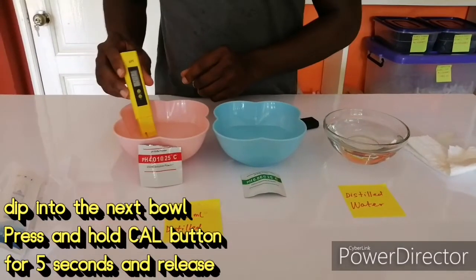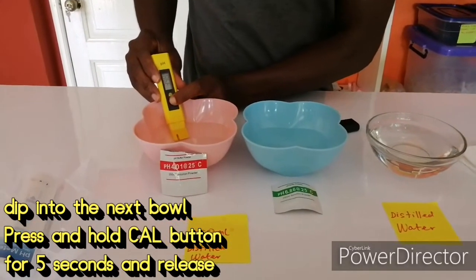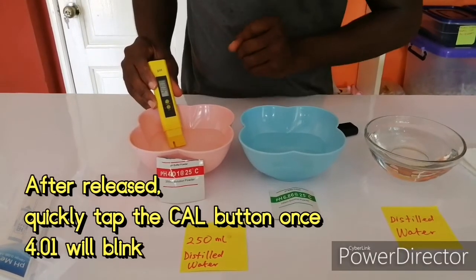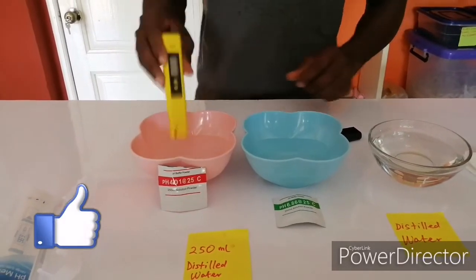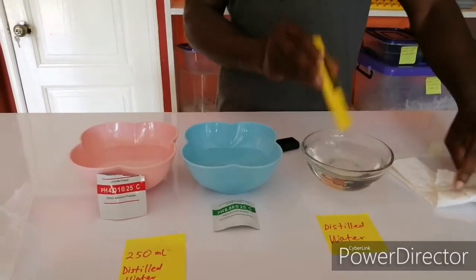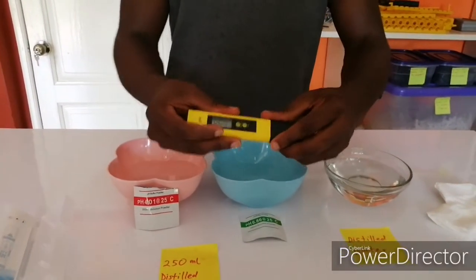Now I'm going to dip it in the 4.01 buffer and hold the CAL button for 5 seconds. Press it once — you see 4.01 — you leave it, it has finished calibrating. You rinse it, clean with a clean cloth, and your calibration is done.